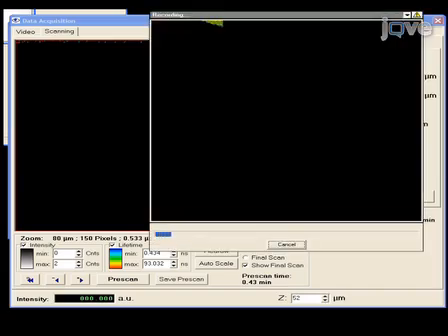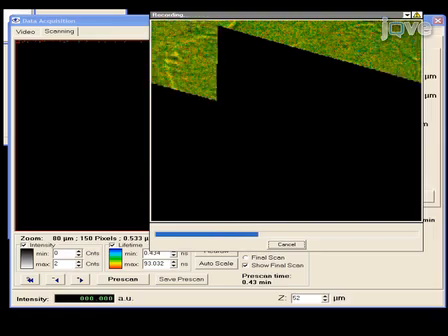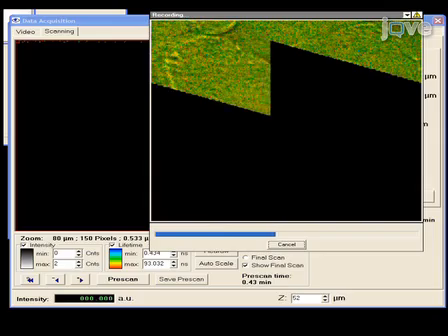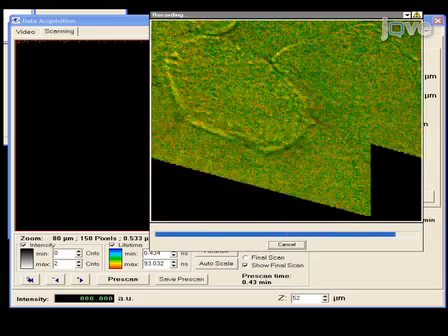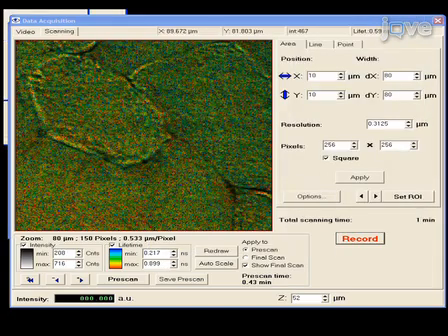Raster scan the objective lens and then use the signals recorded on the APD to generate an image by displaying the photon count rate for each pixel with the data acquisition software. Repeat this imaging procedure for each desired coherent Raman signal so that signals can be compared during post-processing. Now let's see how to properly prepare a sample.